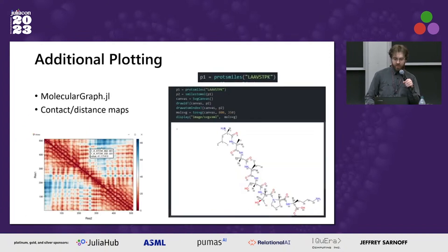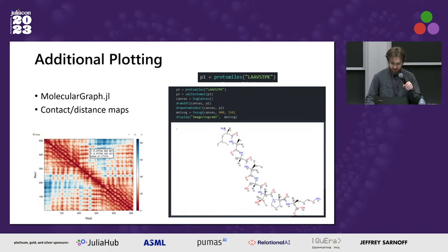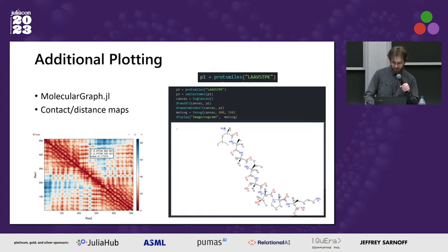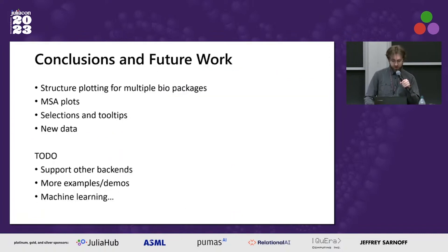There are additional plotting functions beyond protein structures and multiple sequence alignments. You can plot a short protein sequence using molecular graph, where the sequence is converted into a SMILES chemical representation and plotted using ChiroMakie — the 2D canvas display — showing accurate stereochemistry and atomic numbering. Heat maps can be made from distance and contact maps from BioStructures or Midos, and the data inspector tooltips are enabled for those as well.